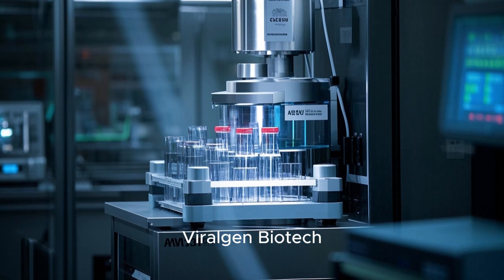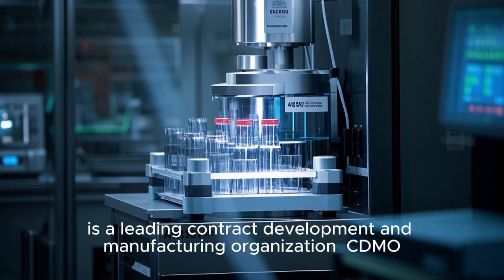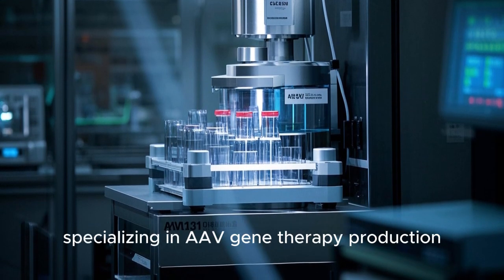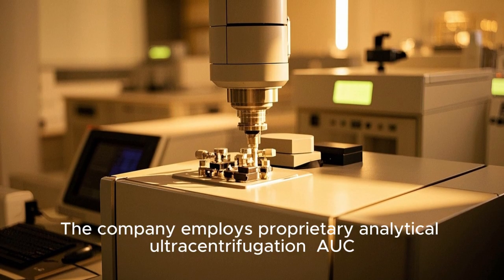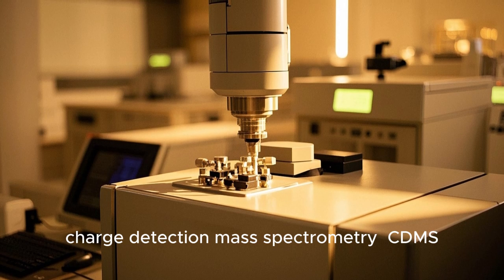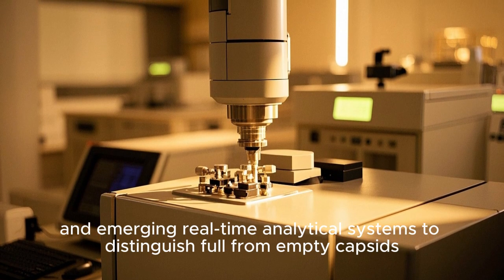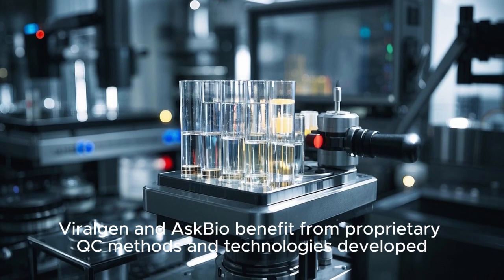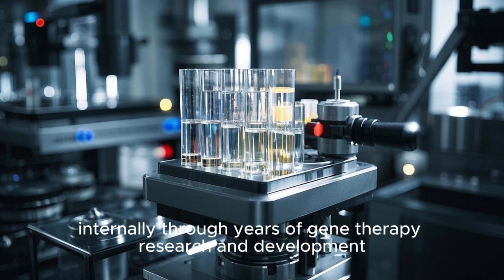Viralgen Biotech, a subsidiary of Bayer's gene therapy arm AskBio, is a leading contract development and manufacturing organization (CDMO) specializing in AAV gene therapy production. The company employs proprietary analytical ultracentrifugation (AUC), charge detection mass spectrometry (CDMS), and emerging real-time analytical systems to distinguish full from empty capsids. Viralgen and AskBio benefit from proprietary QC methods and technologies developed internally through years of gene therapy research and development.